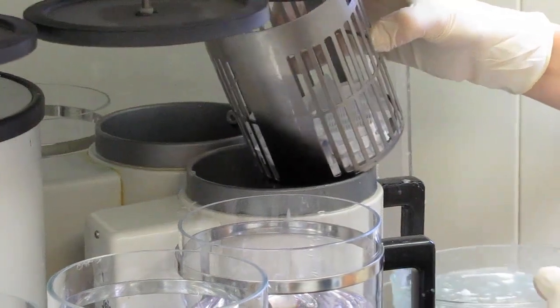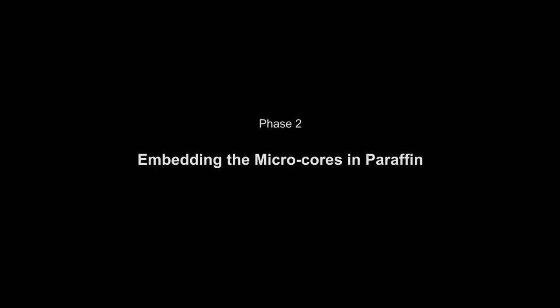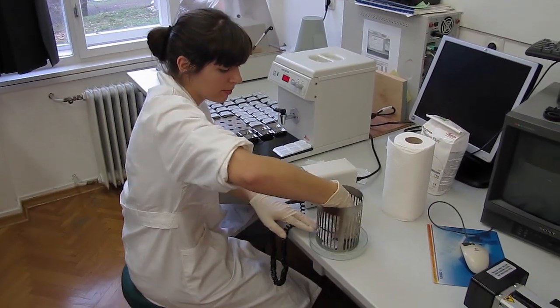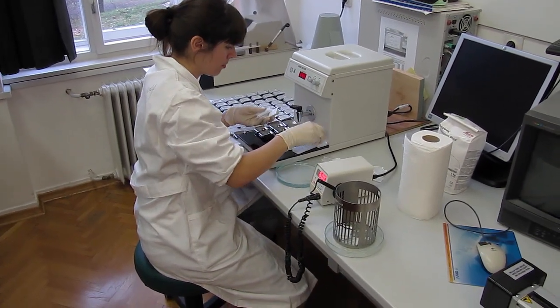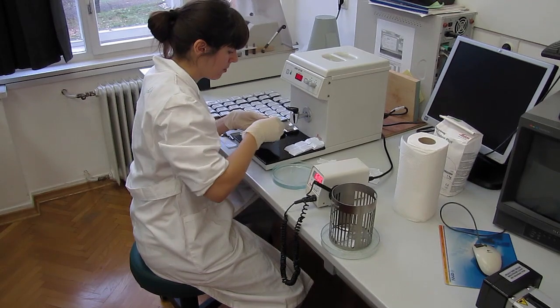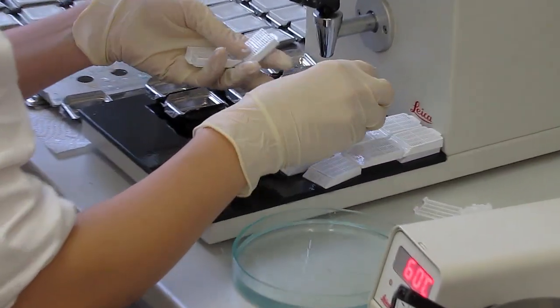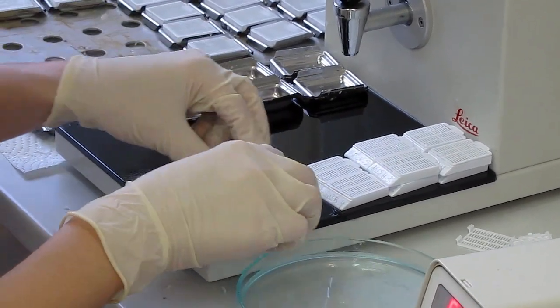After this, the samples can be embedded in paraffin. For preparation of paraffin blocks, we use a paraffin dispenser with a heated plate at around 60 degrees Celsius. In addition, heatable forceps, metal molds preheated to the same temperature, and a petri dish filled with cold water are needed.